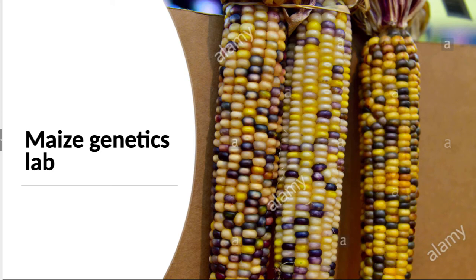In this lab, we're going to be looking at Mendelian genetics in corn plants, and we're also going to learn how to do a simple statistical test in order to determine whether our expectations under Mendelian genetics match what we see in the lab.